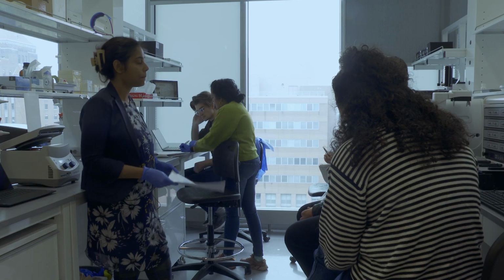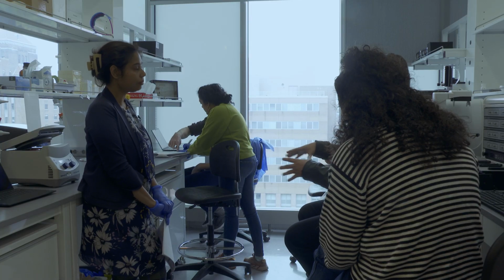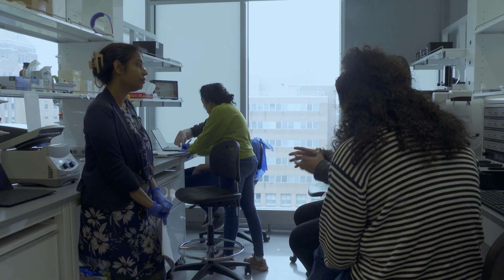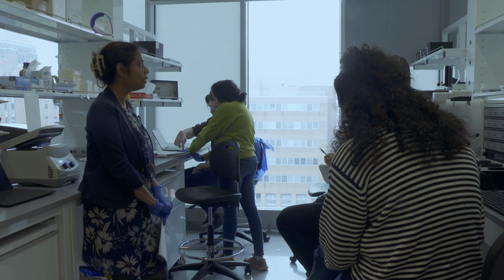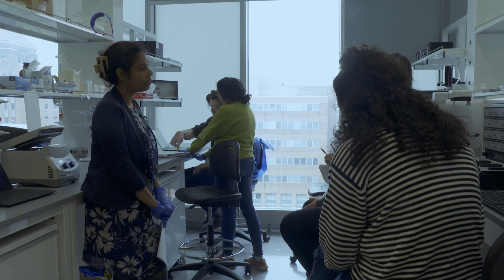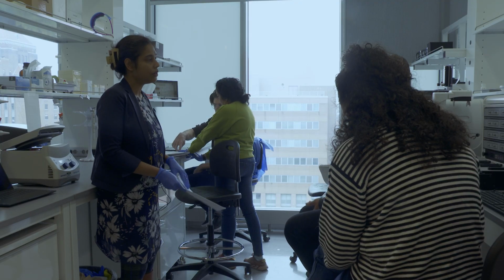Yeah, because when I told you that I used the MinION, when I did the experiment we did PCR for that because the sample was really small. Yeah, so it's the same reason. If you have a small sample, then I think PCR makes more sense. But for these, it's not necessary.